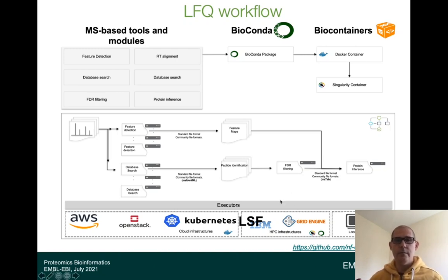A workflow system basically allows you to take all these tasks, create tools for them, and combine those tasks into a workflow or a pipeline. Sometimes some people call it a pipeline. And the workflow system allows you to deploy and run those tasks in different types of environments, including a local machine. Okay, then if you have a workflow, it doesn't stop you from deploying and running your workflow on your machine, on your Mac or on a mainframe.